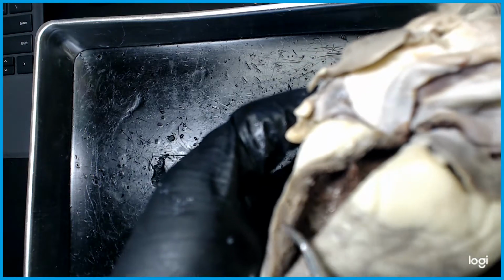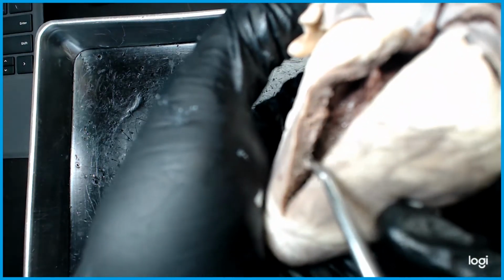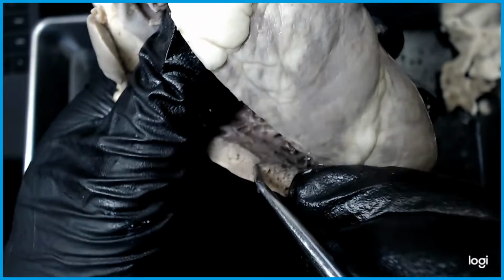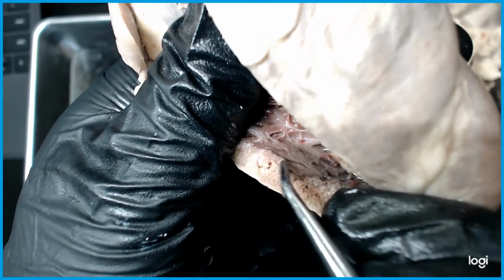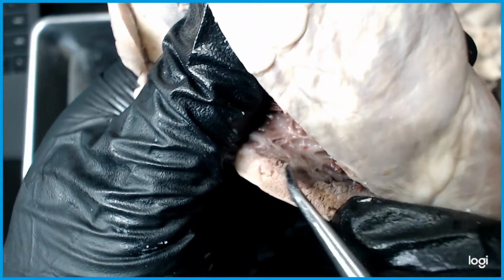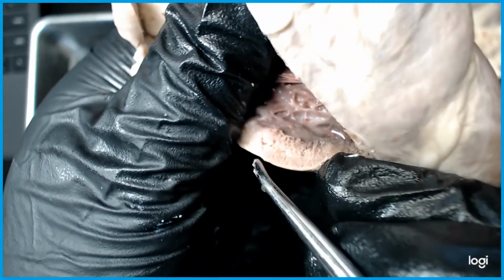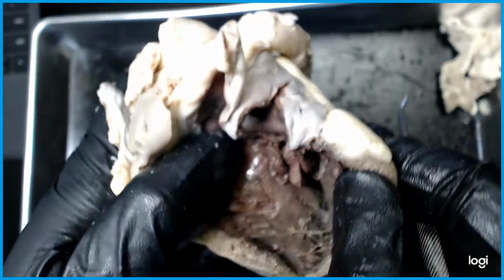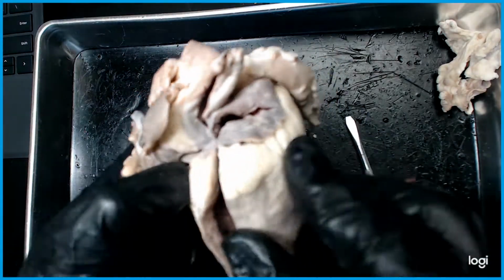Then we have the myocardium, which is the muscle, which is this that I'm scraping. And on the very inner wall, endocardium, endo for the inside. And you see that little color change right there. That's the endocardium right here. Myocardium and epicardium. Okay, 3 layers.